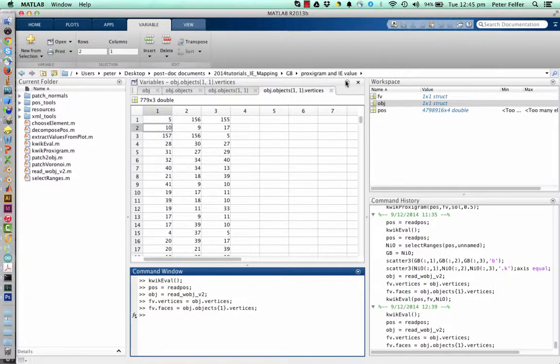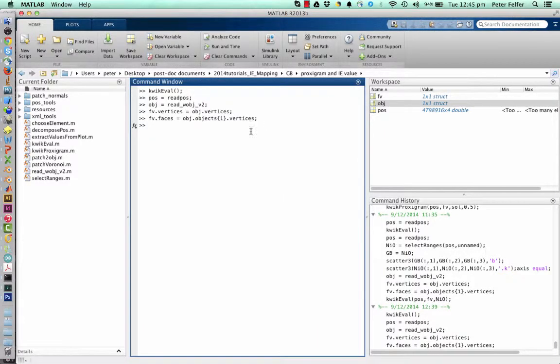And now we've got our analysis object. The last thing we need is actually the ranges, because we need to produce the POS file, or extract just the nickel oxide, which is the species that we want to map, that we want to calculate the excess for. And I'll show you how to do that entirely by hand. For that, we need the RNG file.